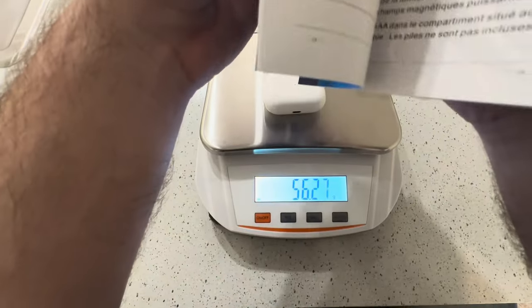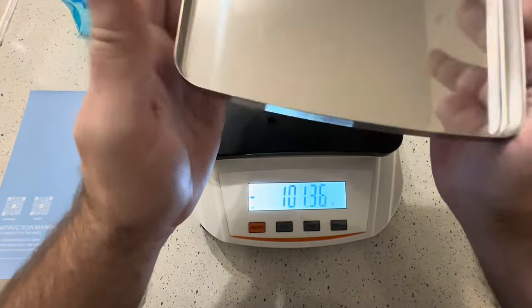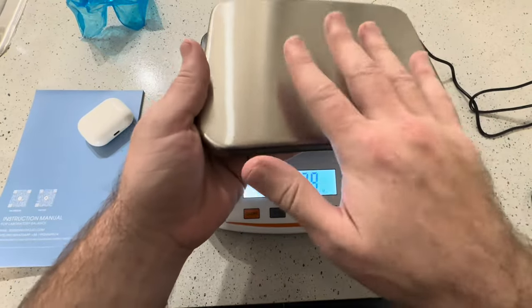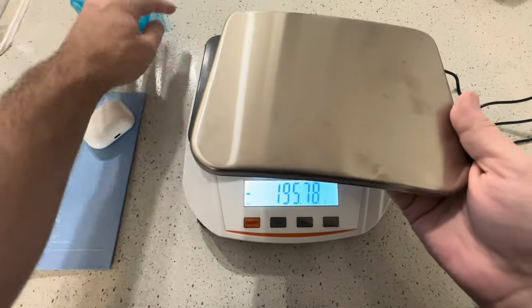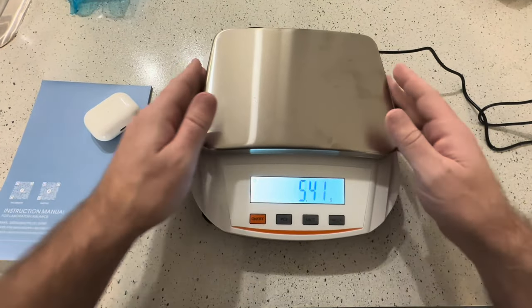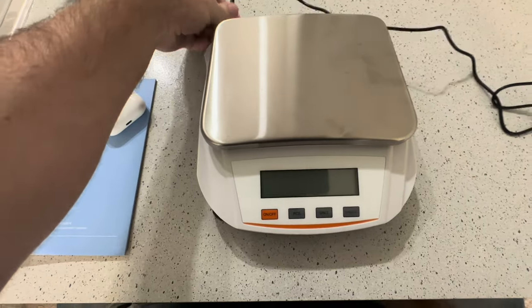If you look in the instruction manual, you can see this is a very accurate scale. I do like that this metal plate can come off, which means you can clean it. If you spilled powder or something on here — since this is for a laboratory — you can definitely clean that off.